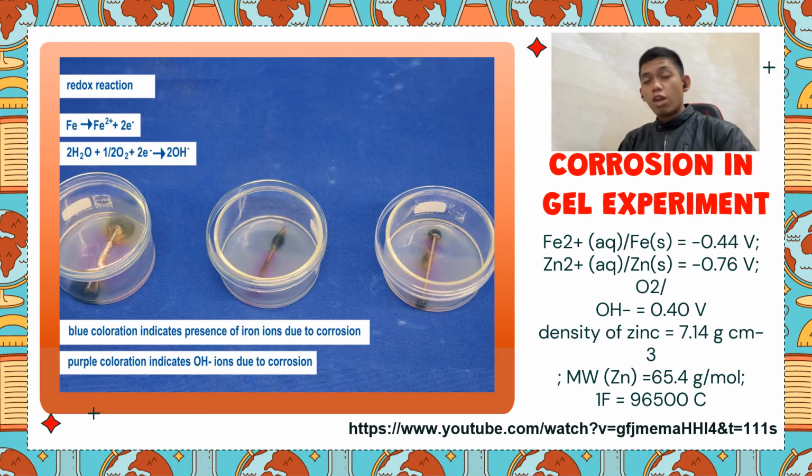After we have finished mixing all the solution, we put the solution into every single container containing all the nails from the previous video.